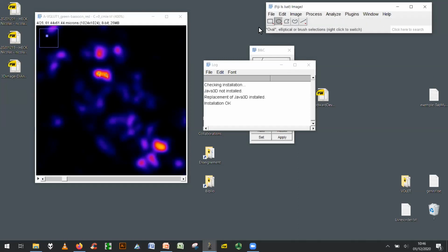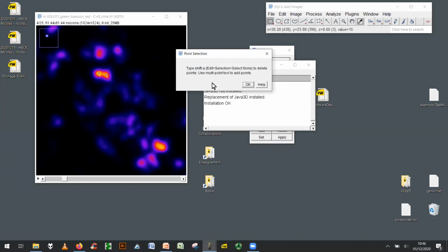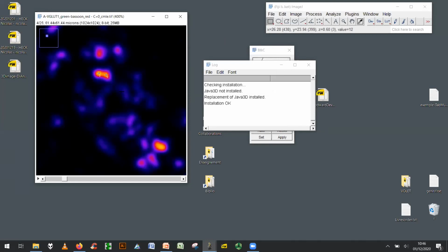So in that case, if you use a radius, then what will happen is that you will put the local maximum, and the other local maximum will not appear because you already spotted the main one, and the radius excludes that you find others. Was I clear enough for you? Yes, yes, yes.